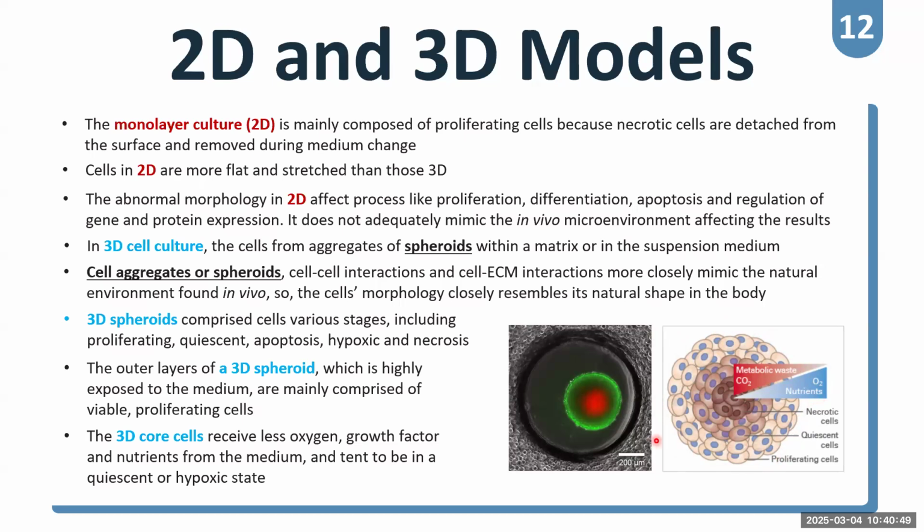Okay, but next inside we call the quiescent cells. It means, I would say, not dead but not growing, something like that. They're waiting for something that activates them again, and then they can grow and proliferate and act as cancer cells.